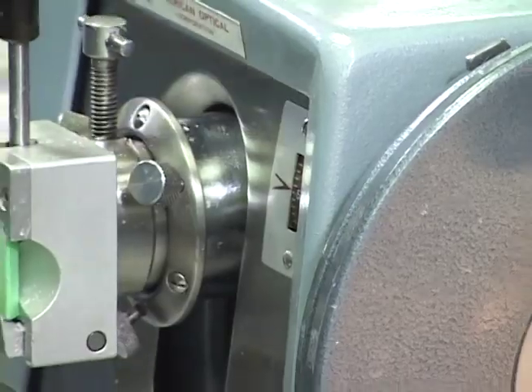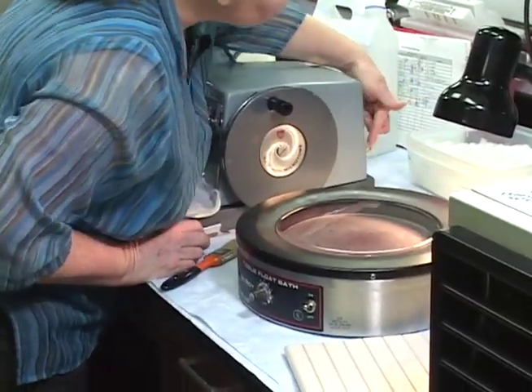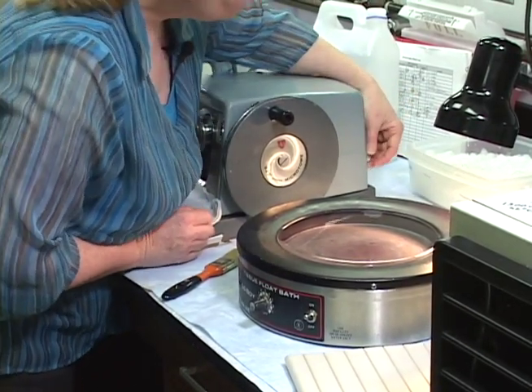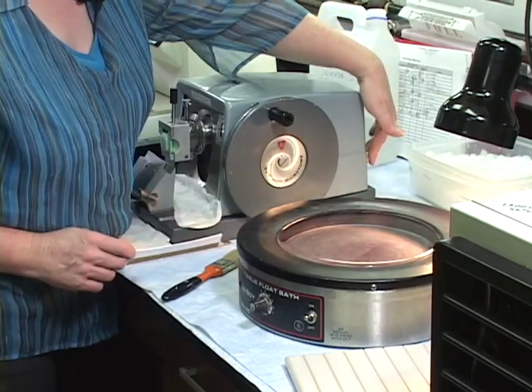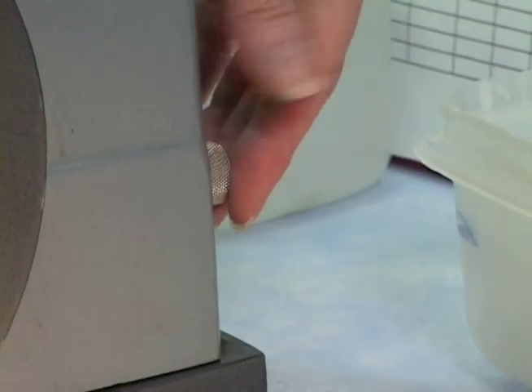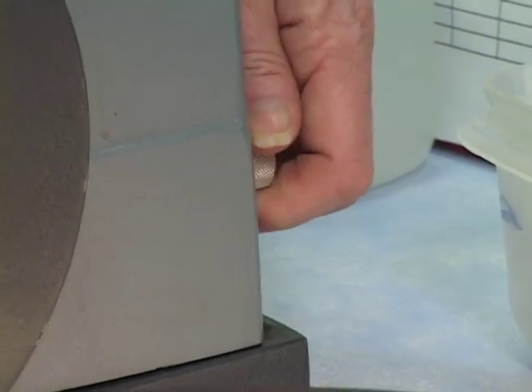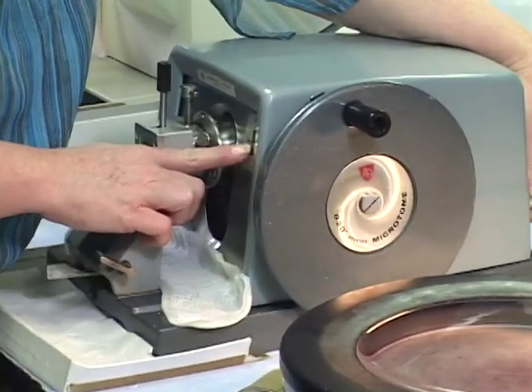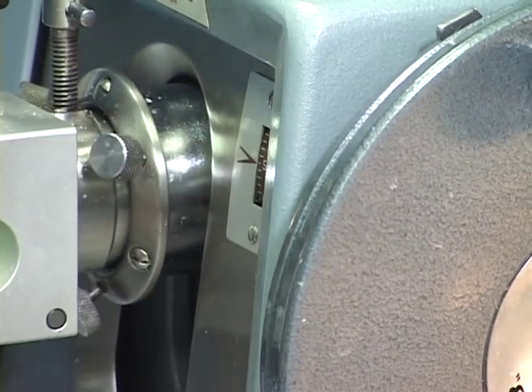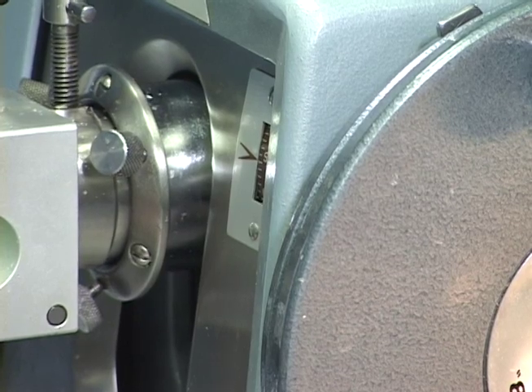the micron level, there's a button in the back. I don't know if you can see this. Anyway, there's a little knob in the back, just immediately towards the back right. I see it. And you just turn that to the desired number. You can get up to 30 and 40 microns on this microtome, and realistically with this microtome, 3 microns is about the level you're going to get.